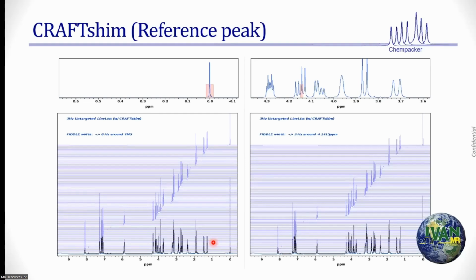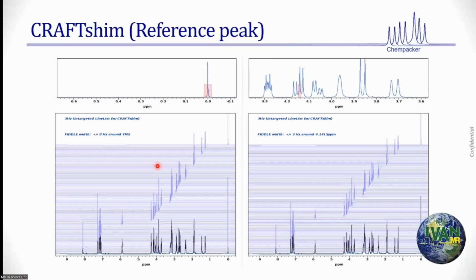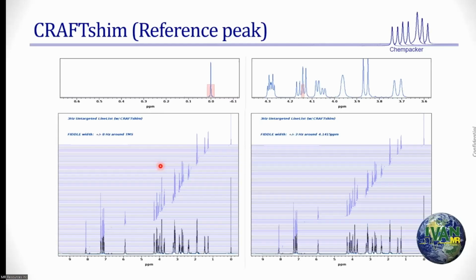But when we do it in a tabular domain, I don't need a 1 ppm window. All I need is a defined peak that I can generate a model of. It can be a peak somewhere. It can be a component of your doublet. In this particular case, it is a component of a doublet of a doublet. I don't care. As long as I say that's a peak, it's supposed to be a singlet because it's one of the multiplet components of a large multiplet. It's supposed to be a single exponential decay function. I can do the same thing, and then we will talk about how I compare those two downstream in a minute. So these two give the equivalent result.